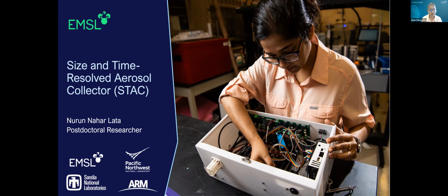So, good afternoon, everyone. I'm Nurun Nahar Lata, a postdoctoral researcher at EMSL. Today, I'm going to talk about one of EMSL's newly developed aerosol research capabilities, STAC, which is a size and time resolved aerosol collector.